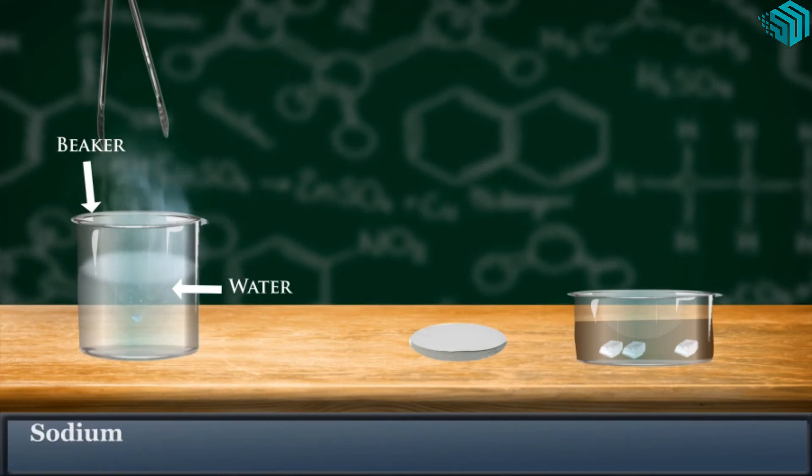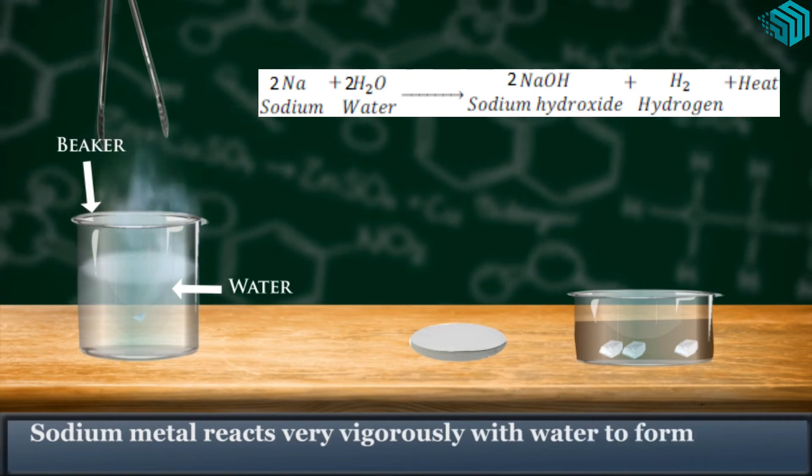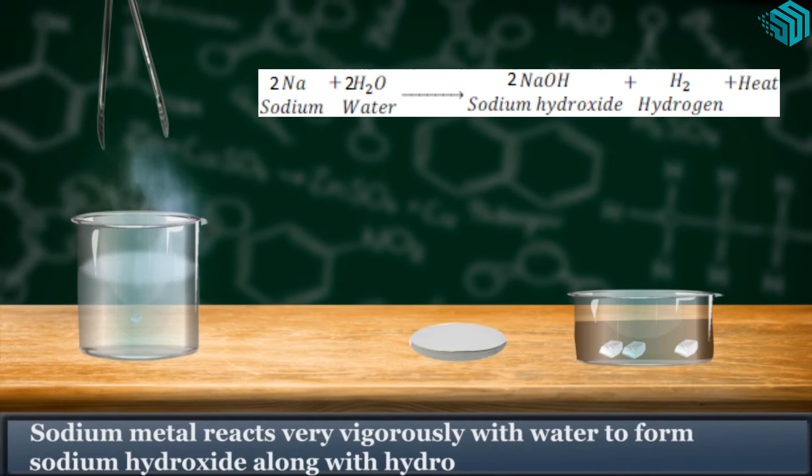Sodium metal reacts very vigorously with water with lots of heat.